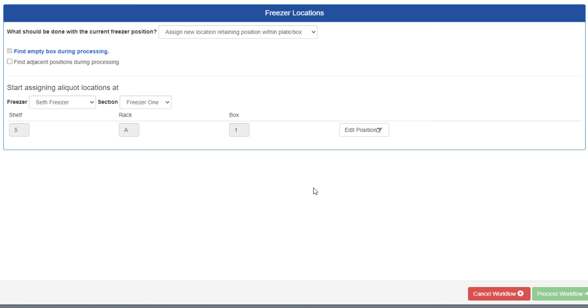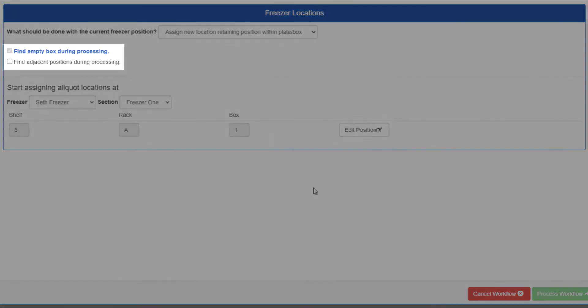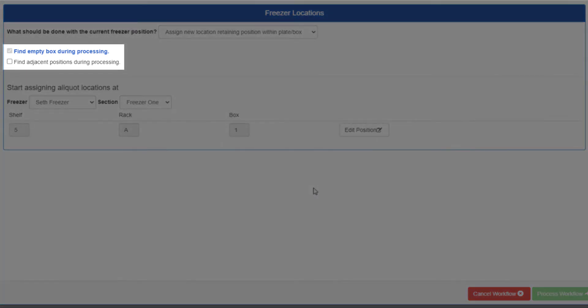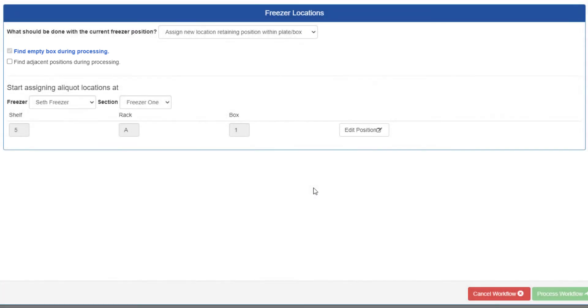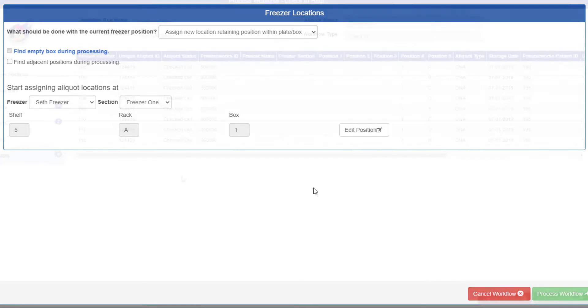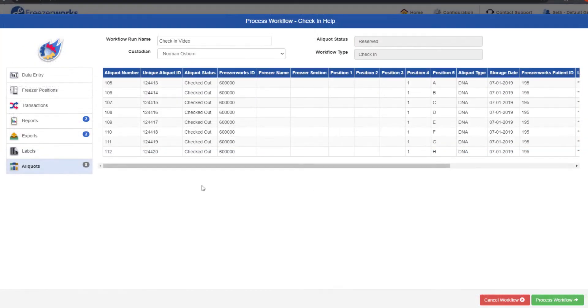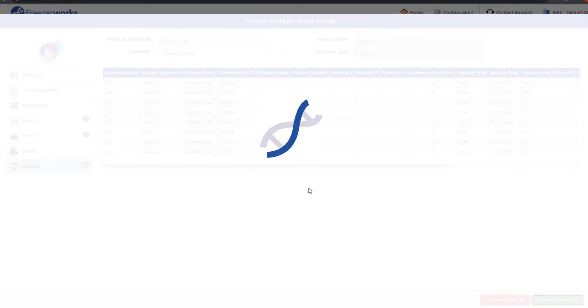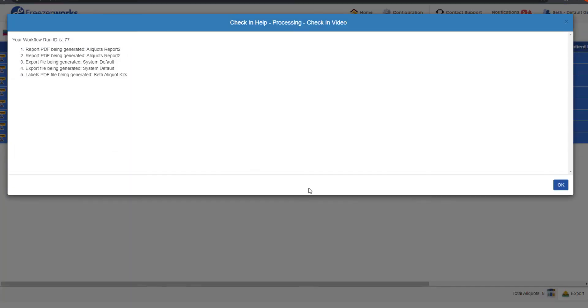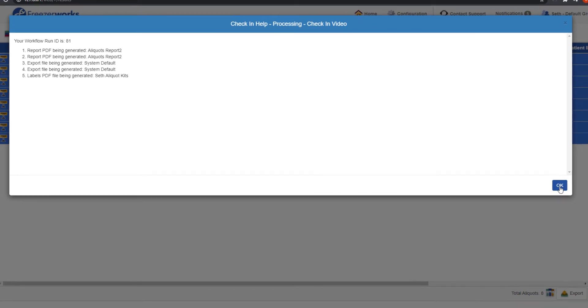Also remember you have access to the standard assignment options, find empty box and find adjacent positions. Use them if you need to. The rest of the workflow process should be very familiar. Once you're ready, process the workflow. You'll get a confirmation just like last time, before being returned to wherever you started the workflow.